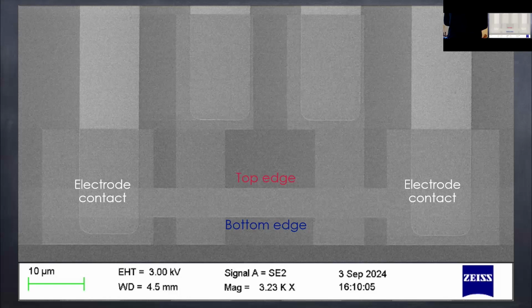Did you do any simulation, like COMSOL, to confirm? Let me tell you, what we have done is transport measurements. We don't even have classical Hall effect measurements in the material. The only thing I can tell you is that the things you're mentioning will not change the ratio of the L3 signal. That is not going to happen. I don't see any physics by which temperature would change L3 and L2 differently.